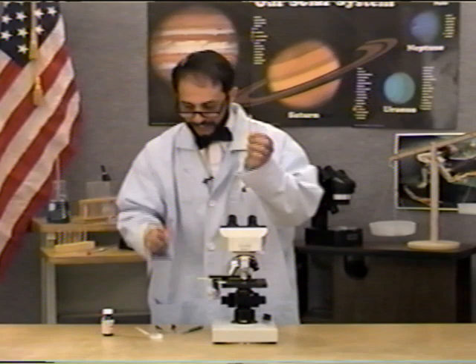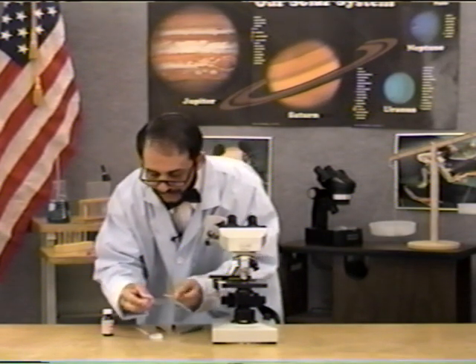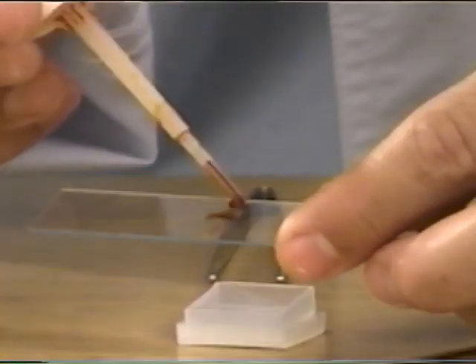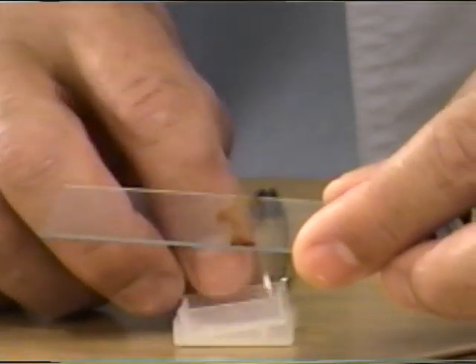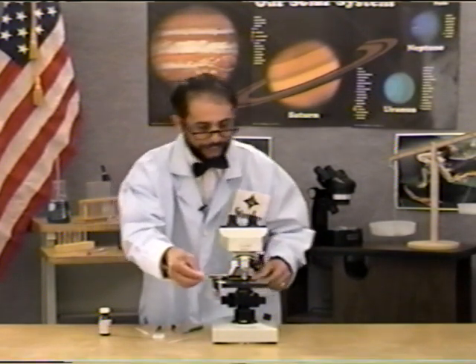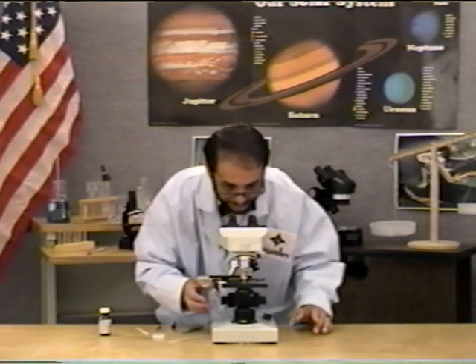Then we take the result and we scrape that sample carefully onto a slide, stain it with a little bit of iodine, and carefully cover it with a clean cover slip. We put the resulting slide into our microscope, take some time to focus.